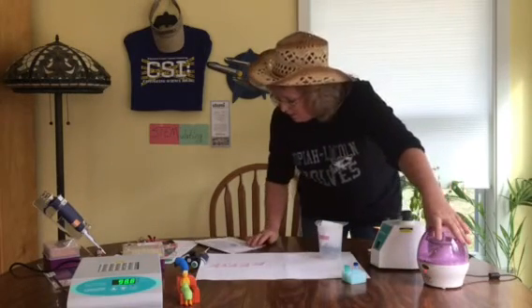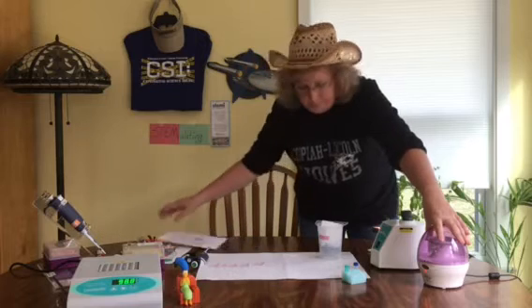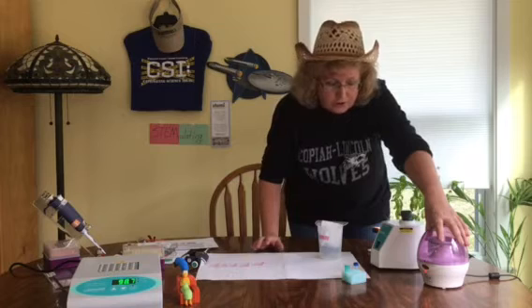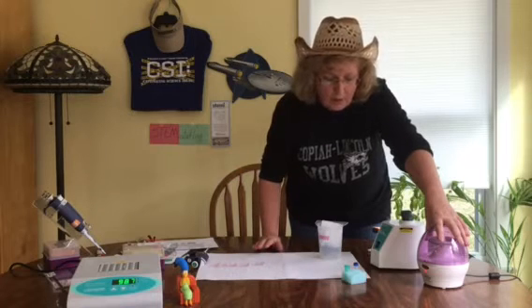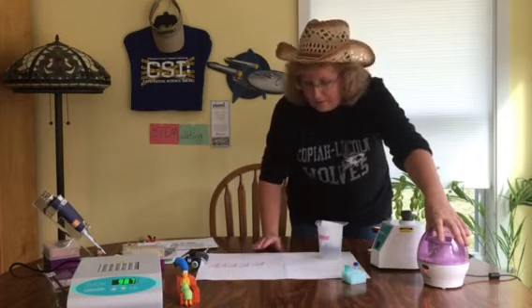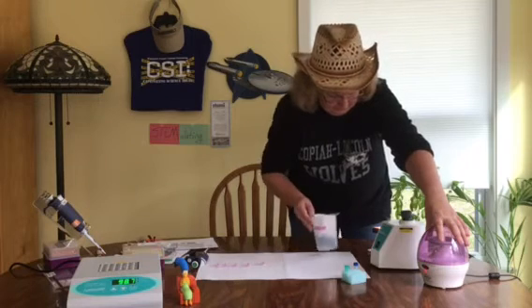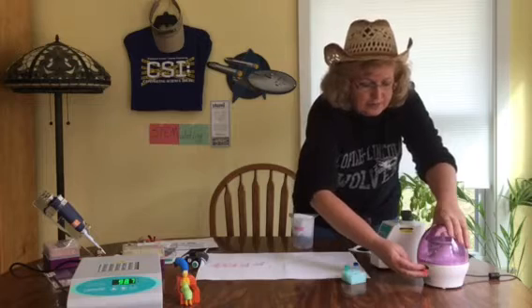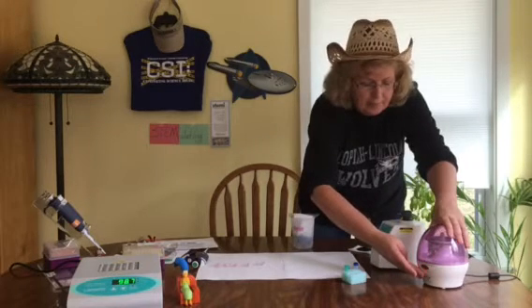It's supposed to run for 10 minutes. Sometimes you have those a little bit older. They might not quite be as quiet as others, so you might want somebody to hold it. Okay, say time's up. Let's stop it.